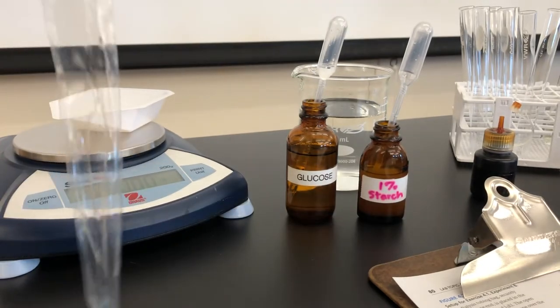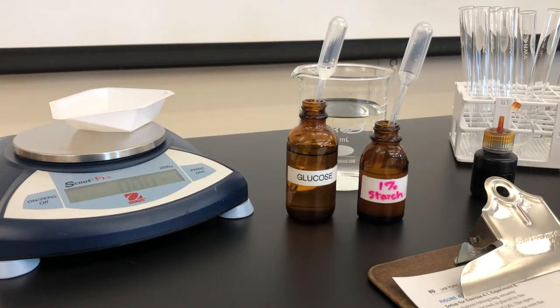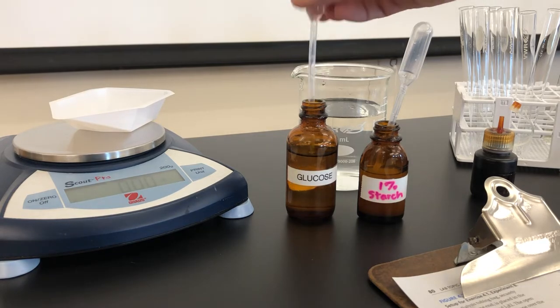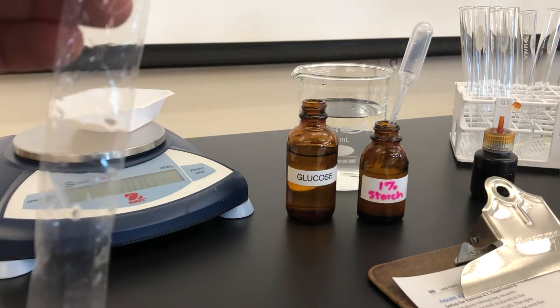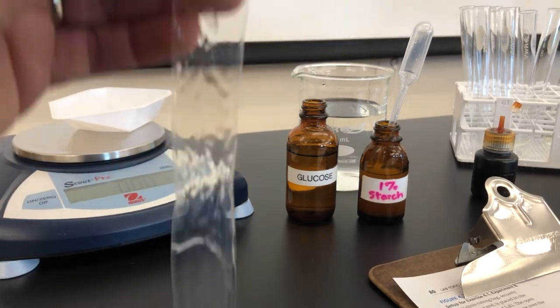Into this bag we're going to place both glucose and starch. The directions say four pipettes full. I'm going to use four milliliters.